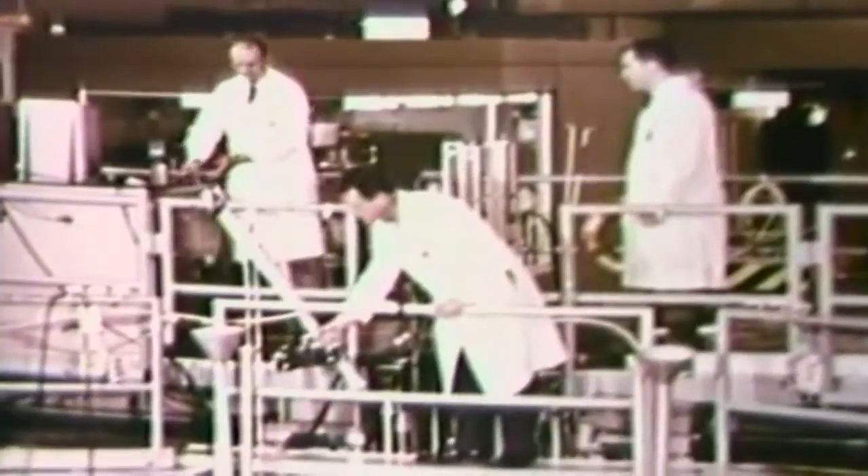The packaged bone sample and arsenic standard are lowered to the reactor core using an ordinary fishing pole. This keeps the operator at a safe distance from the induced radioactivity of the samples when they are removed from the core. The reactor core, deep under the pool which cools and shields it, operates routinely at a power level of one megawatt.